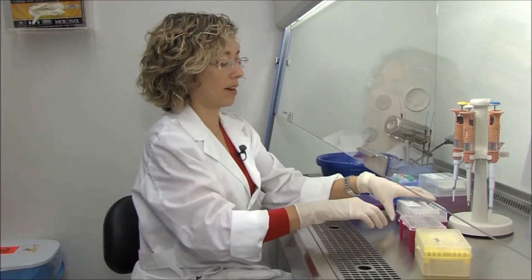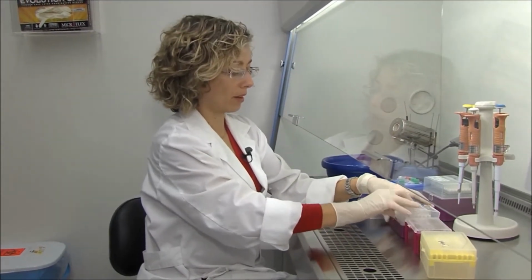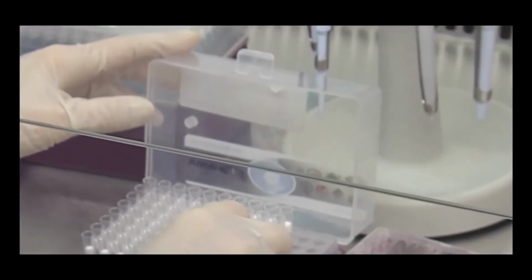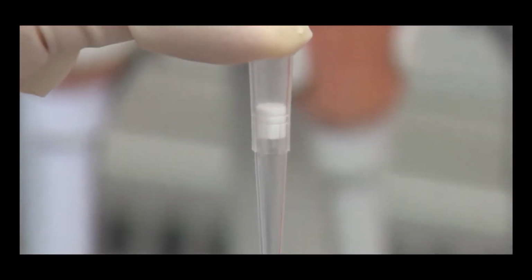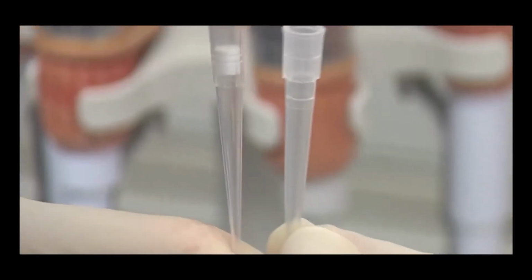Before I start, I want to make a couple of comments. We are going to use for a PCR filter tips, which have this filter in the middle. And we're going to use that to prevent contaminations. The difference between a filter tip and a standard tip, you can see here, it's only the filter.